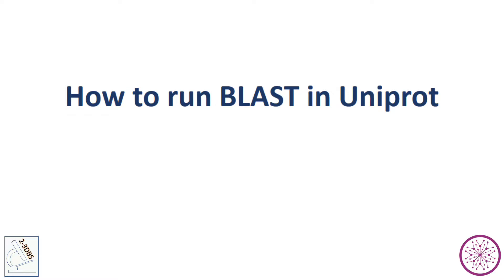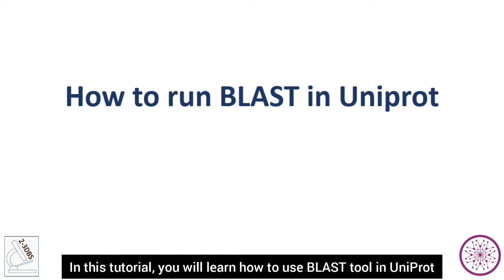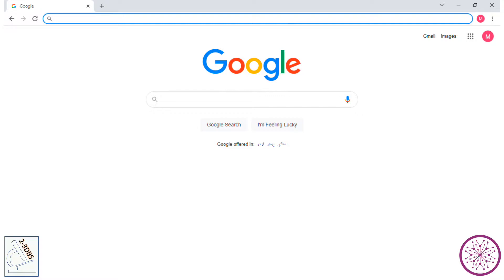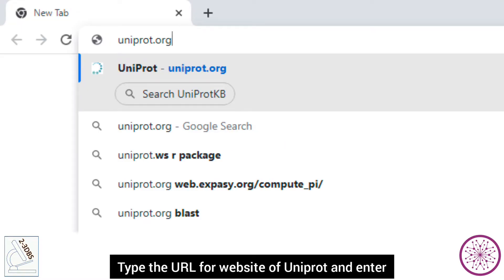In this tutorial you will learn how to use the BLAST tool in UniProt. First, open your browser, type the URL for the website of UniProt, and press Enter.